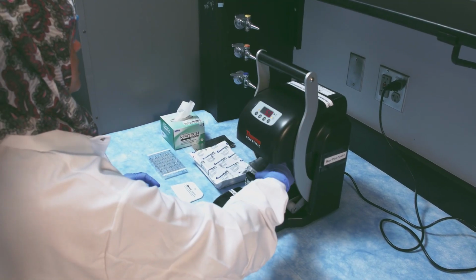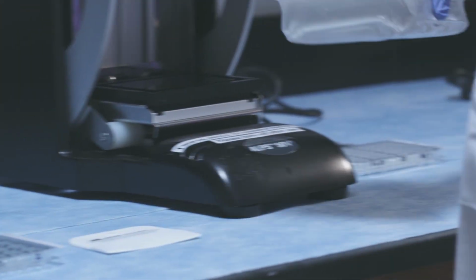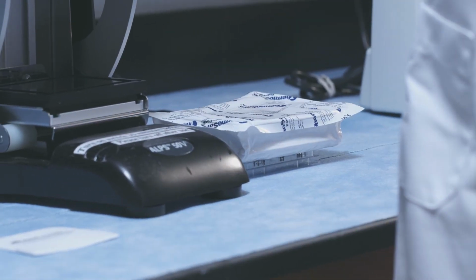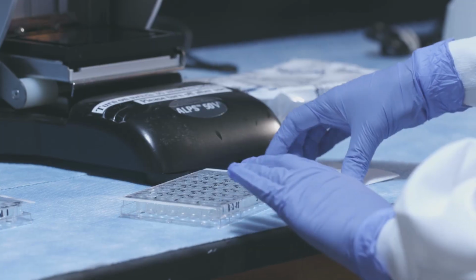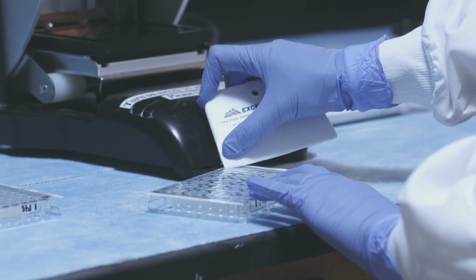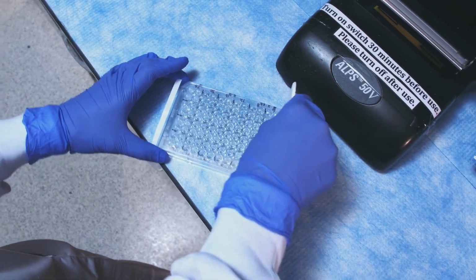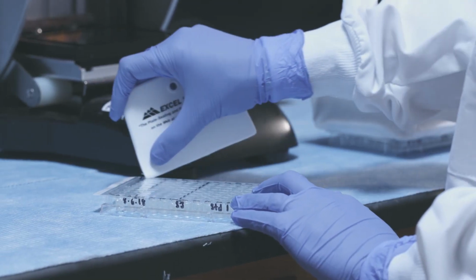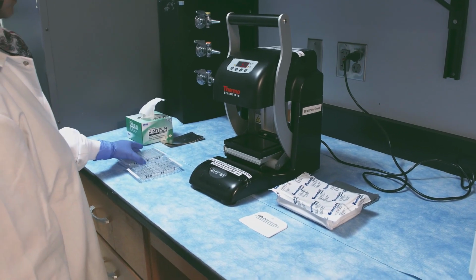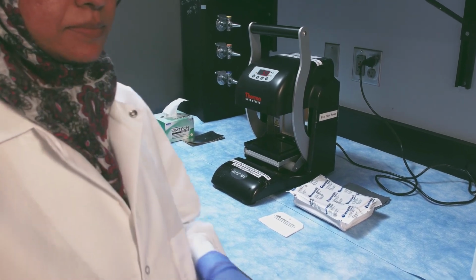Remove the foil membrane and immediately place an ice pack on top of the plate for a few seconds to cool down the membrane. Apply additional manual sealing to prevent leakage and thus improve precision. Use a flat object to press the sealing membrane down and to seal edges and corners. Now the plates are ready for incubation.